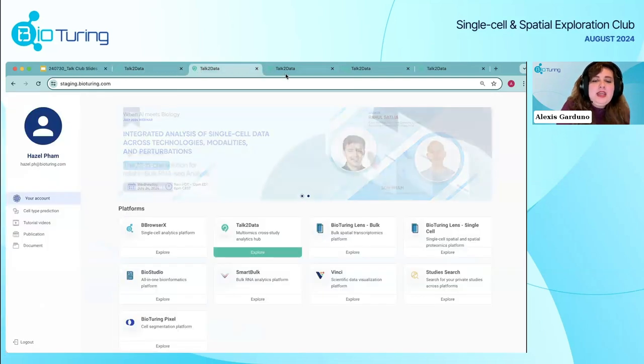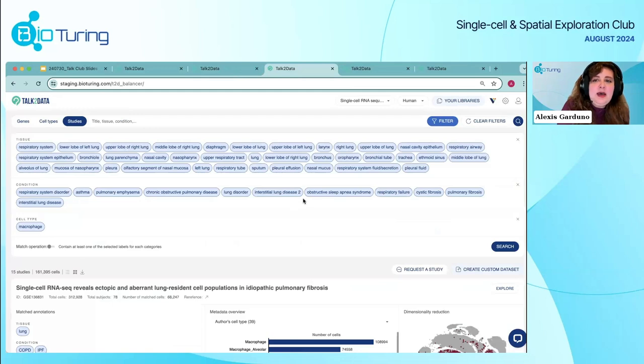If I go back into my atlas, there is another part where you can take this even further. If you're trying to analyze, okay, what are these insights giving me and how can I analyze further? How do these two targets cross-link and express across different areas in the lung? How can we move from single cell RNA-seq into spatial transcriptomics analysis and be able to reference, okay, what area in the lung, and is it only specific to respiratory system disorders or also lung cancer as well?